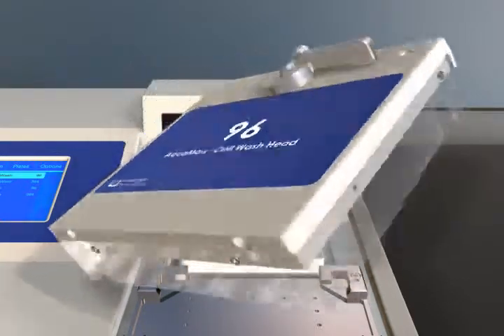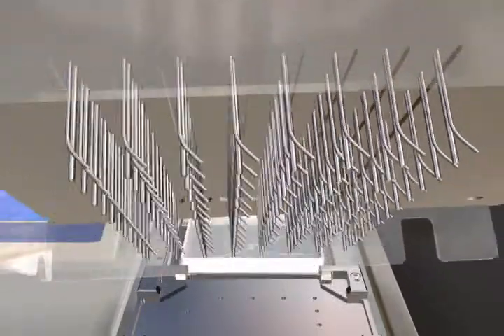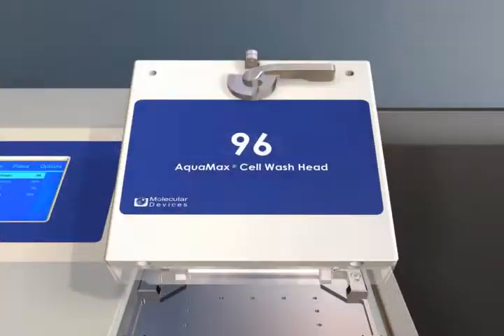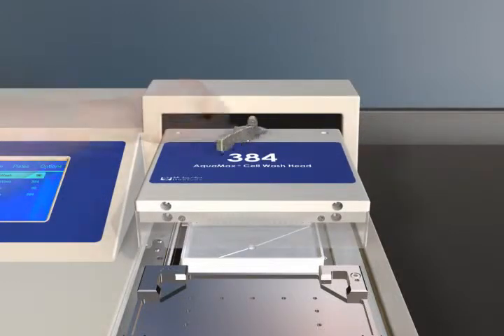The various head designs, such as straight pins and angled pins, provide the ability to run both robust biochemical assays as well as gentle processing of cell-based assays without cell disruption.